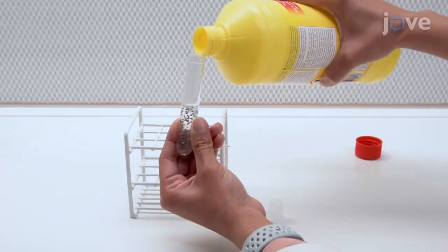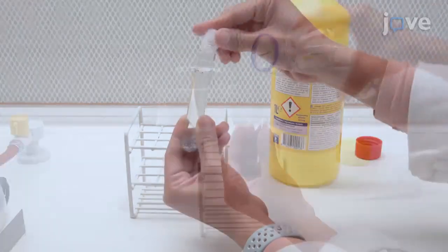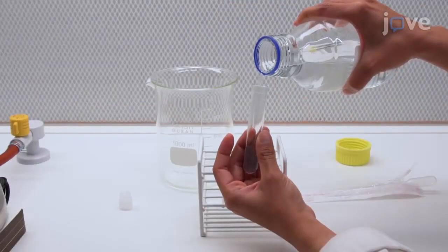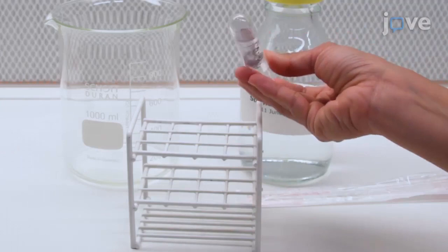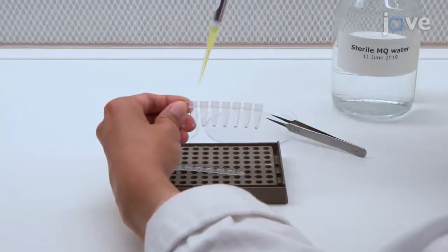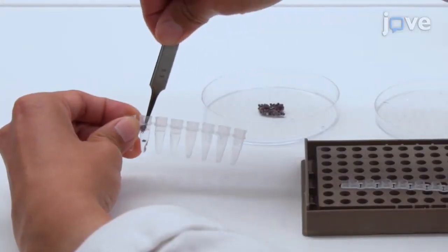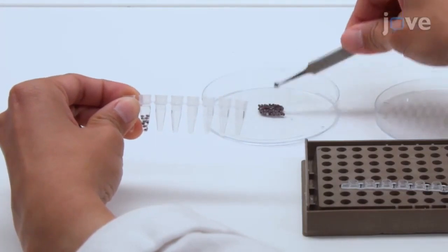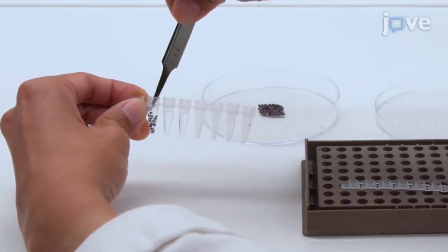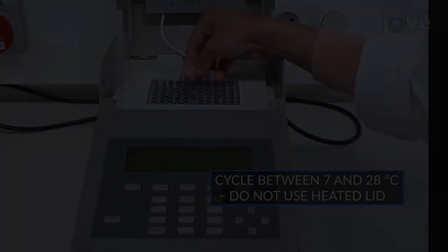Disinfect seeds using 4% hypochlorite bleach for 15 to 20 minutes, and then wash the seeds six times with sterilized water. Transfer the seeds to sterile 200-microliter PCR tubes and fill the tubes with sterilized water to submerge the seeds. Incubate the tubes for 10 days in a thermosystem.